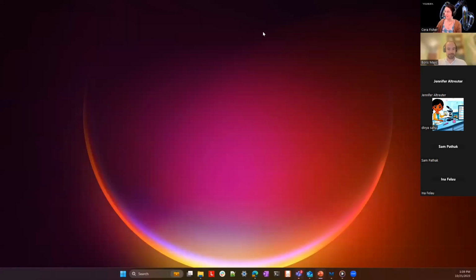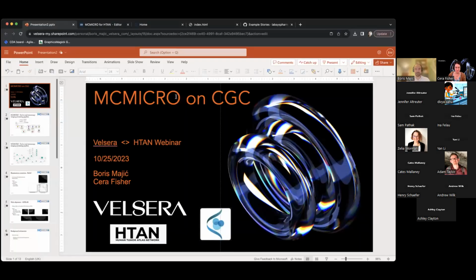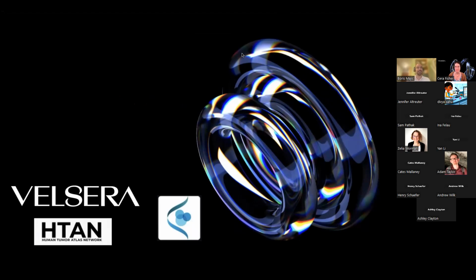Oh, thank you, Cera. Let me just share my screen and start the presentation. Thank you for the great introduction. It was a joy working with people both from HTAN and from Harvard University's Laboratory of Systems Pharmacology.